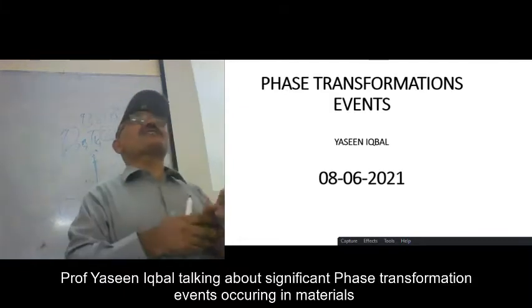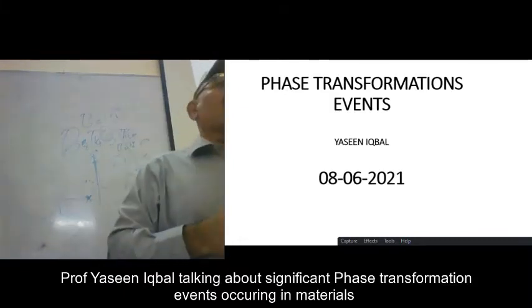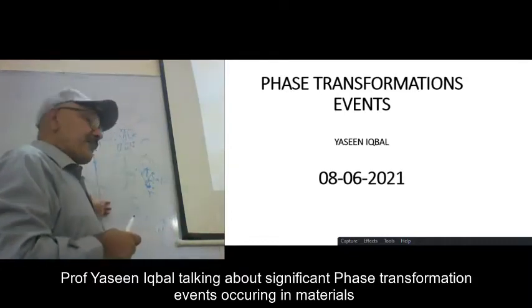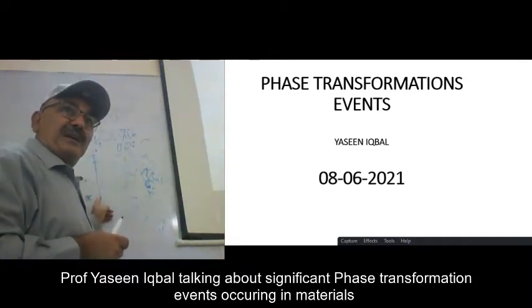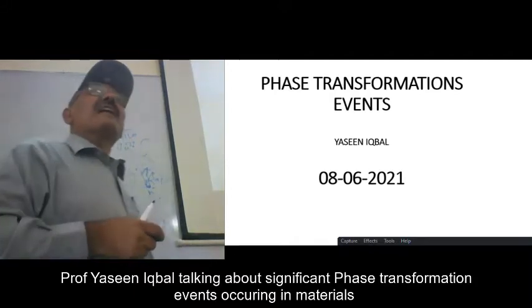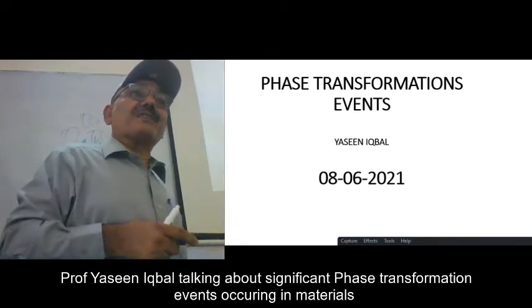This never means that the material will not crystallize at other temperatures. The material will crystallize at all the temperatures within this peak, but the ideal temperature will be that one, and you give it the name optimum crystallization temperature.